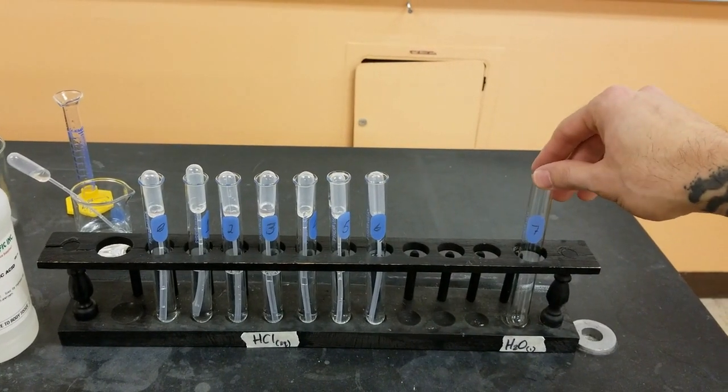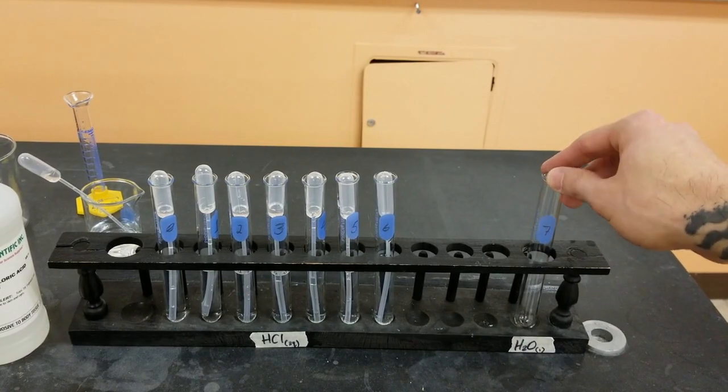Now for test tube 7, I'm just going to be filling that with some plain distilled water.